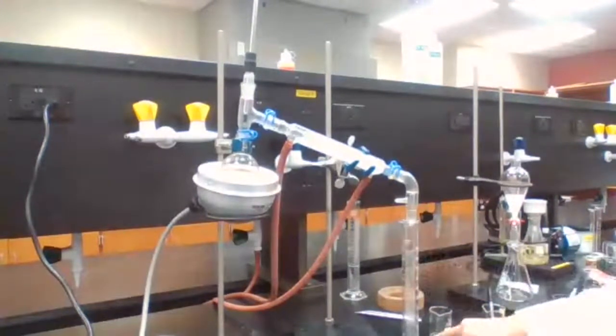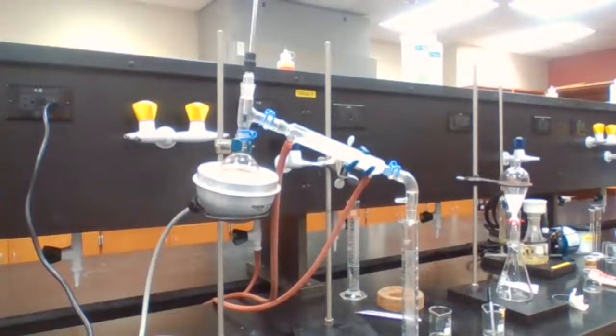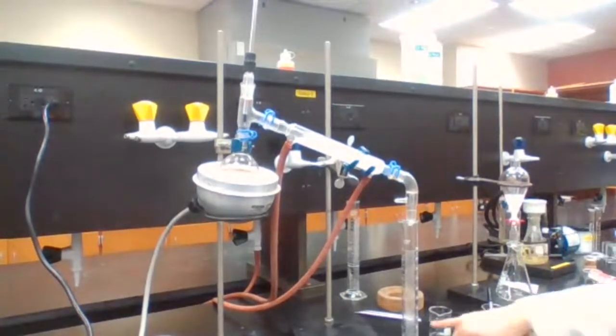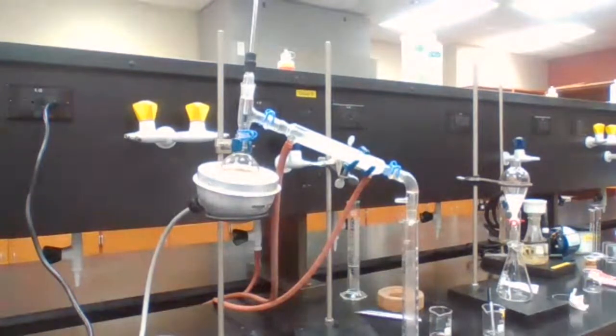Okay, about 5 more milliliters, and we should be fine, because we already have 30, so just wait for 5 more milliliters of the distillate.